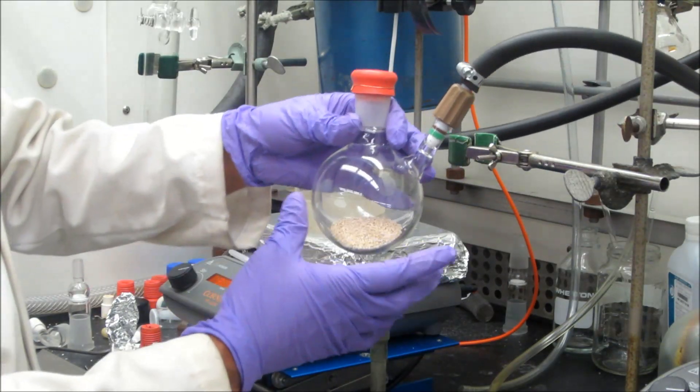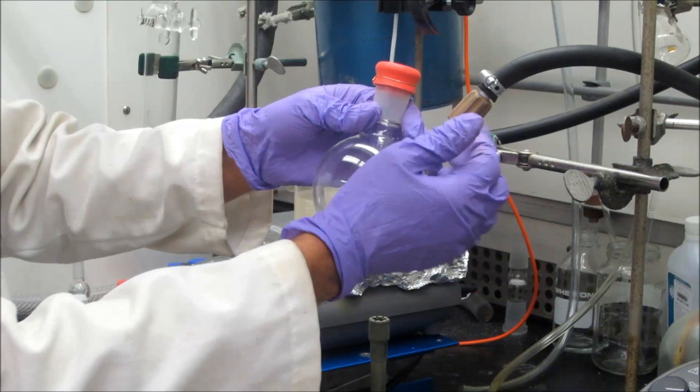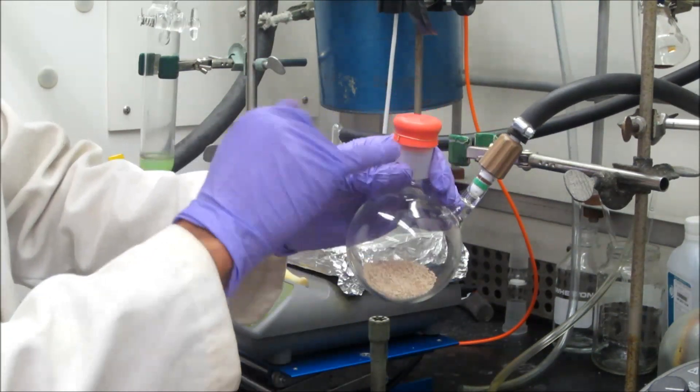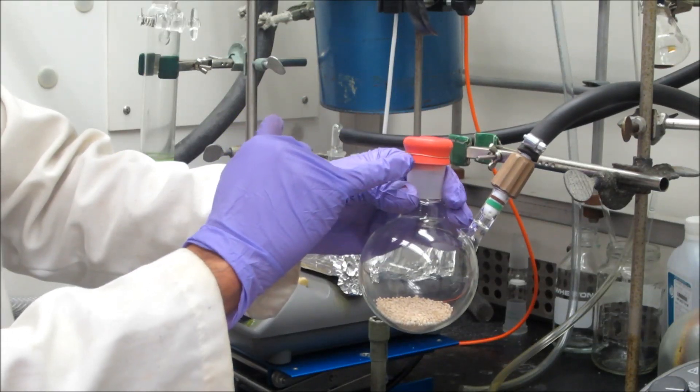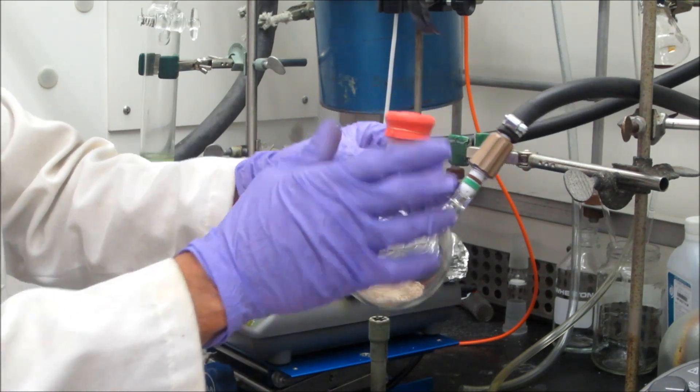And so we've got the schlenk flask with our sieves. We've got this needle valve that will allow us to put this under vacuum, close it off, put it under nitrogen, close it off. And then we've got a septum with some copper wire tied around it rather tightly to ensure that the septum itself is airtight.